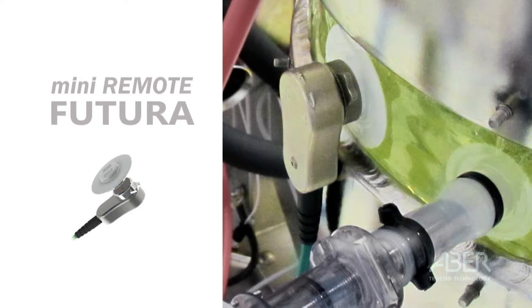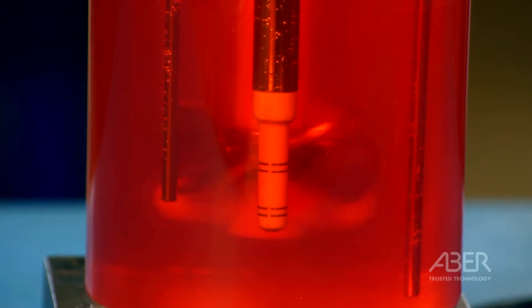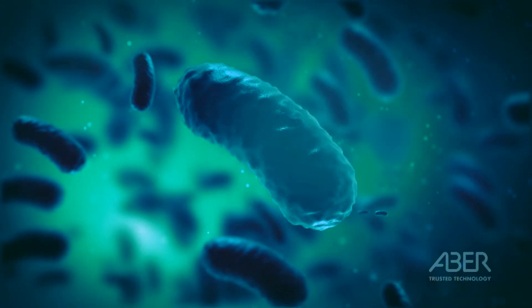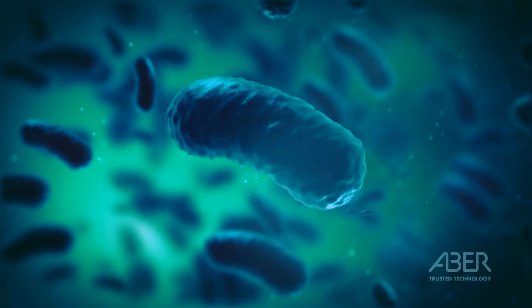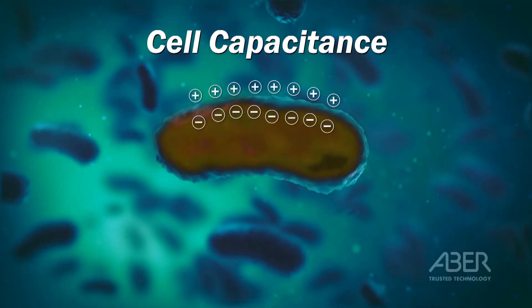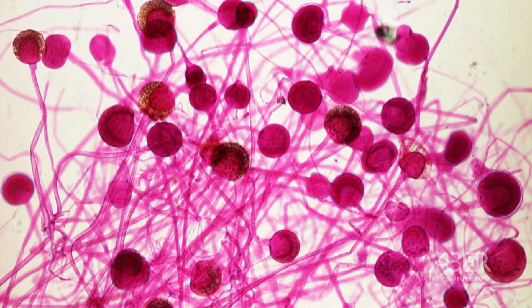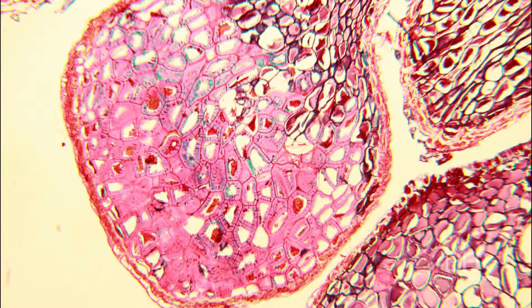It incorporates an ultra-lightweight pre-amplifier for connecting to ABBA disposable probes. The Futura range of probes works on the principle that a cell membrane is an insulator to electricity, which means that when exposed to an electrical field, a viable, intact and healthy cell will become polarized and therefore act as a capacitor. The principle applies to yeast, bacteria, mycelial fungi, animal and plant cells.